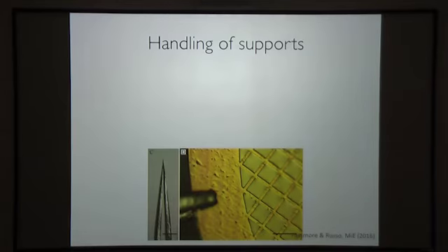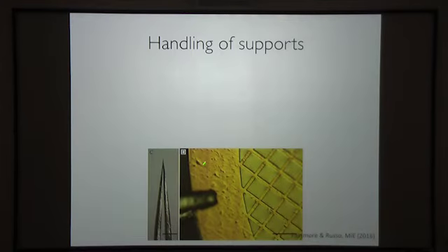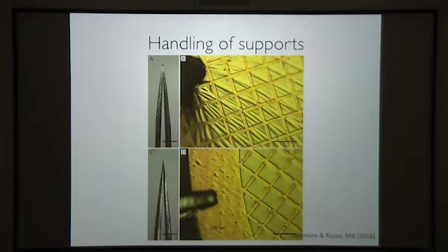It's also really important to handle the grids at the rim. So this is the tweezers. They should be holding just the rim. Crystal showed a nice image yesterday of a grid that's been damaged by tweezers, and this is the kind of thing that happens. Although that grid had some good data on it, you can see that the integrity of the foil is really compromised if you don't handle the grids properly. I think this can really degrade the performance of the grids. You see how far this damage extends.